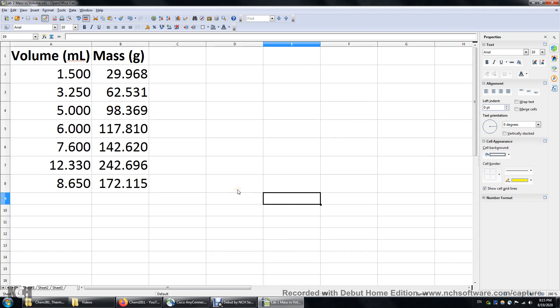In this video I will determine the density of an unknown metal using the volume and mass data in this OpenOffice spreadsheet.